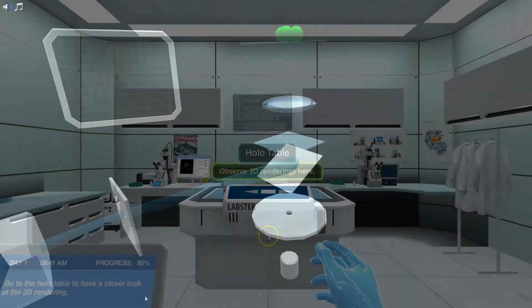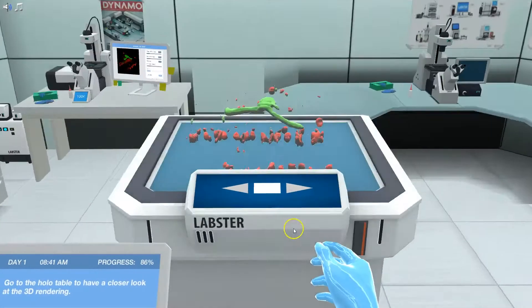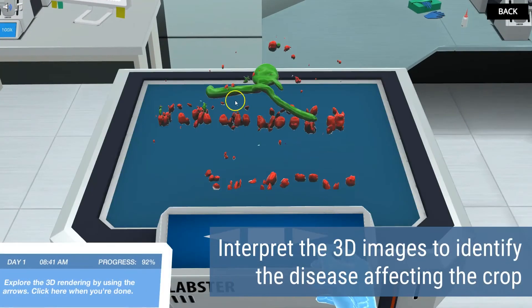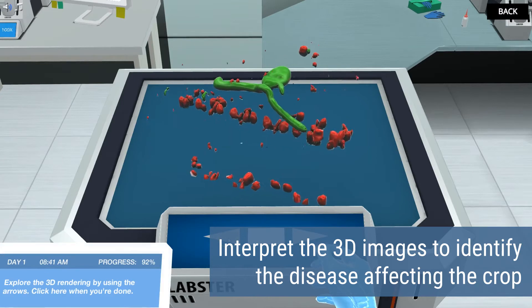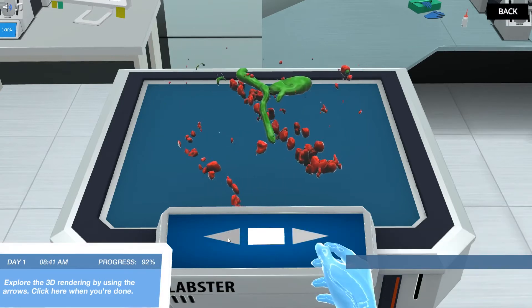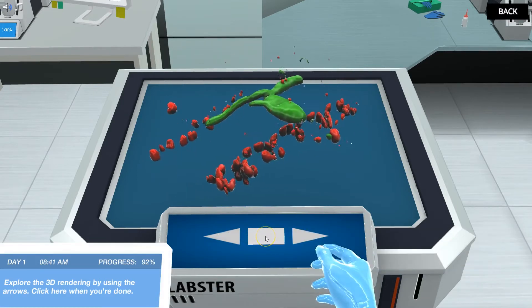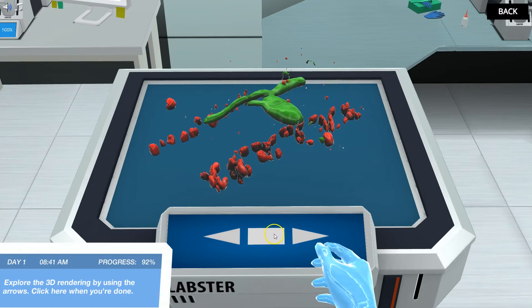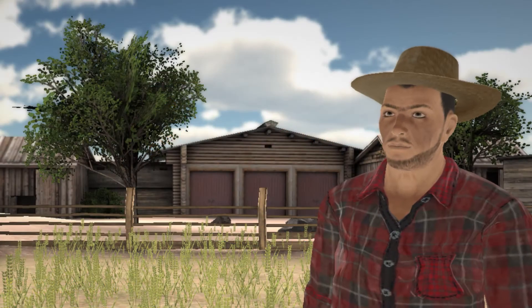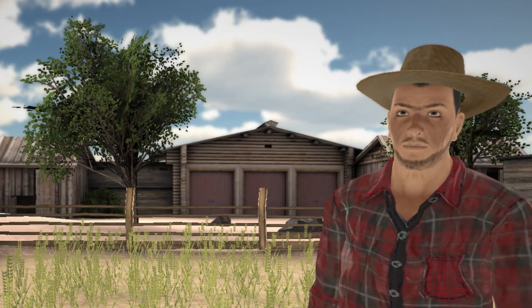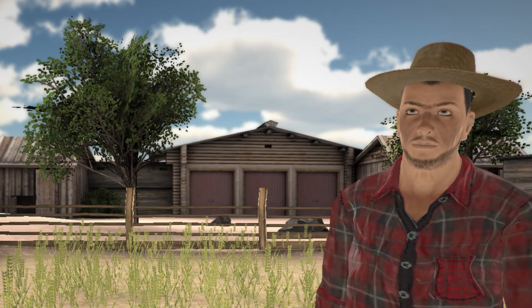In the last mission, you will interpret the 3D structure and identify the type of disease your uncle's crop is infected with. Will you be able to save your uncle's harvest by recommending him a treatment for the plant disease?